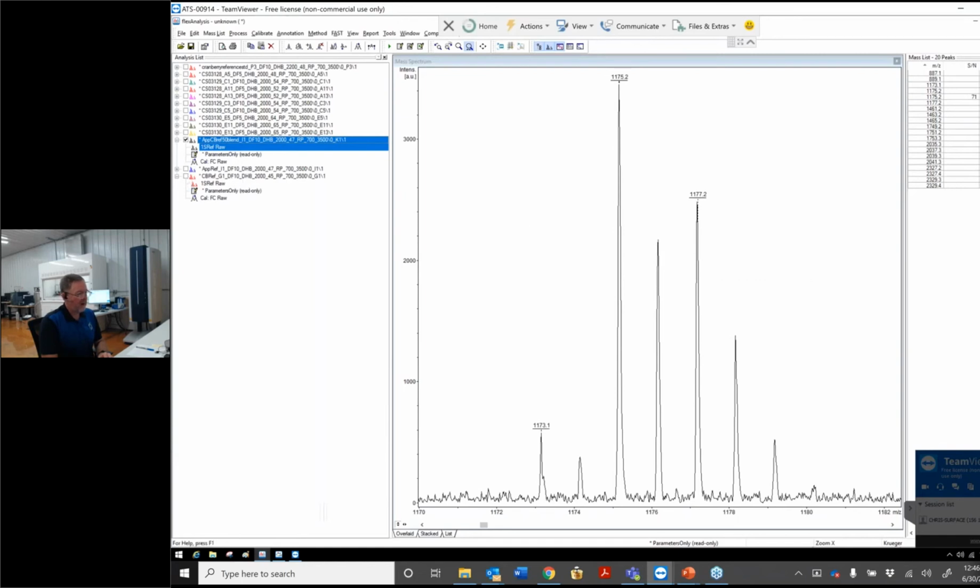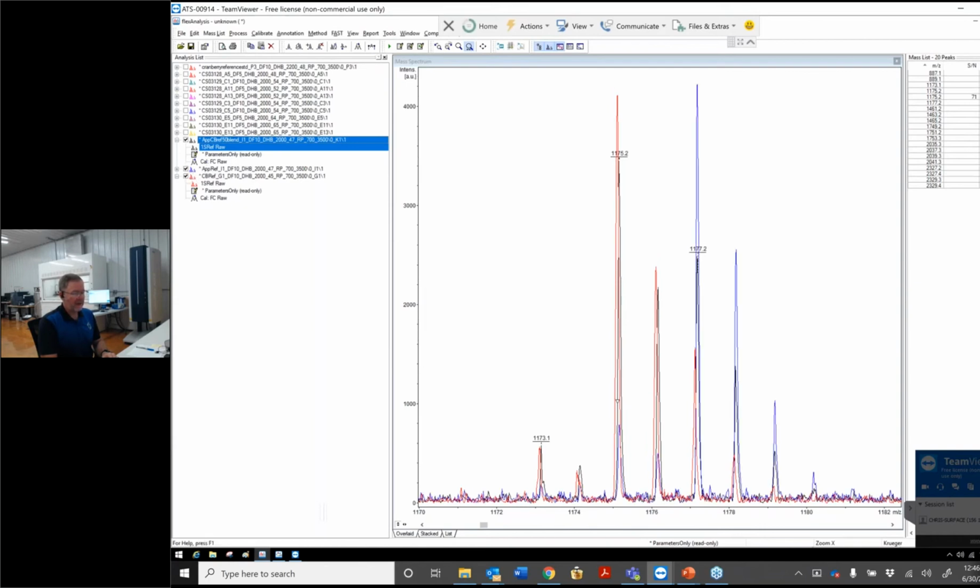I'm going to overlay again the Cranberry so that we can see the difference here. So Cranberry, the red, continues to go down, where the unknown sample, this particular peak, is exceeding our expectation of height. So we would suspect in this case that this product was adulterated with another source of proanthocyanidins. And having built a robust library of potential adulterants, we can make a determination then that it's likely that this adulterant is apple proanthocyanidins, because this peak here in blue now is indicative of an apple all B-type interflavan linkage.